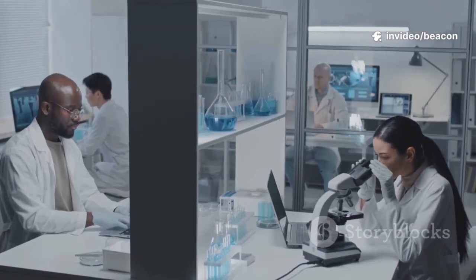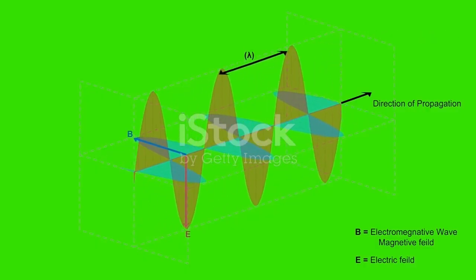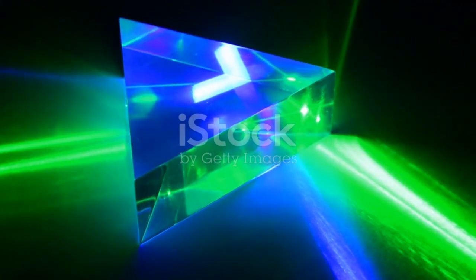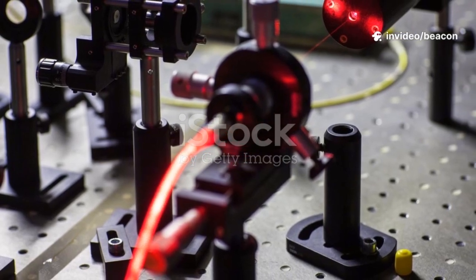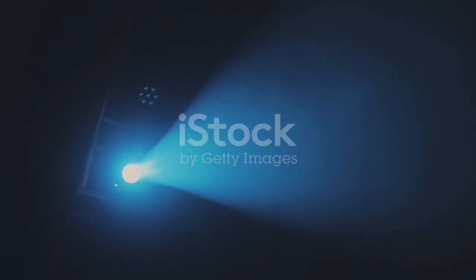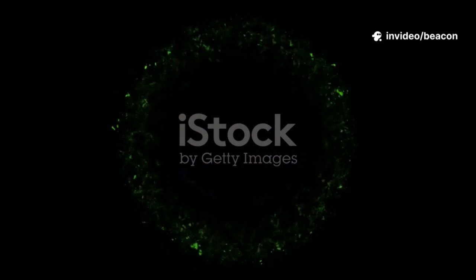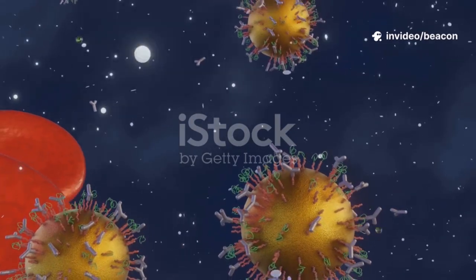Everybody is looking for the tiniest details in science. But what if those details are smaller than a wavelength of light? That's where DLS comes in. DLS is all about shining a laser through a solution and watching how the light scatters. Think of it like using a flashlight in the fog. The way the light bounces helps reveal the size of those invisible particles. By analyzing how the scattered light changes over time, DLS can tell us the average size and even the size distribution of particles as small as a few nanometers.